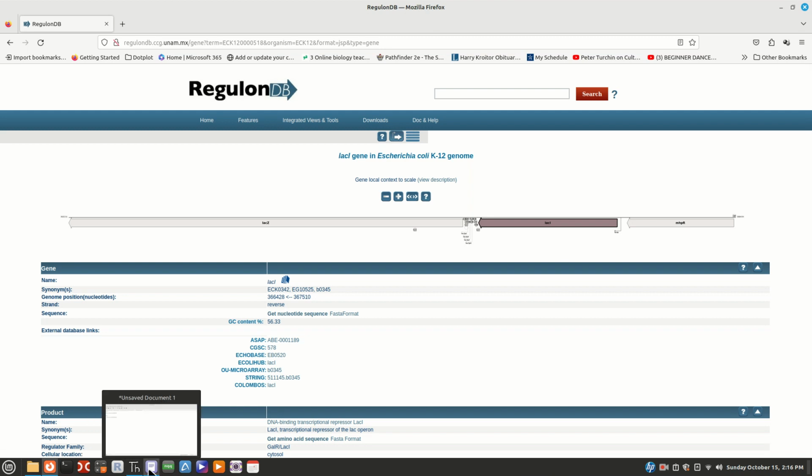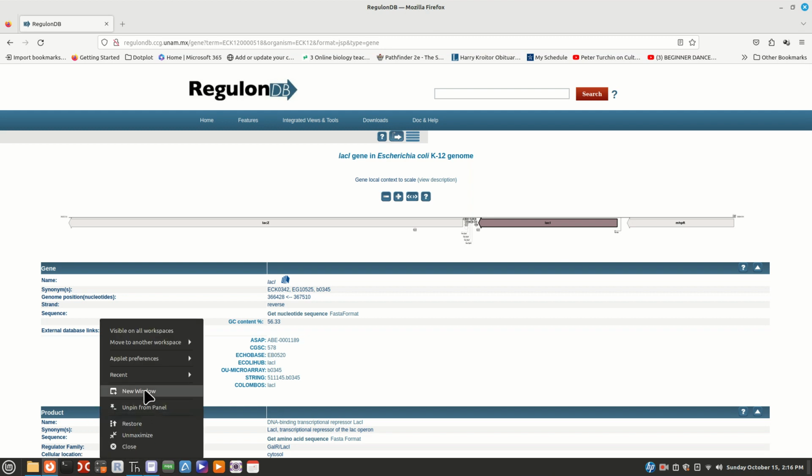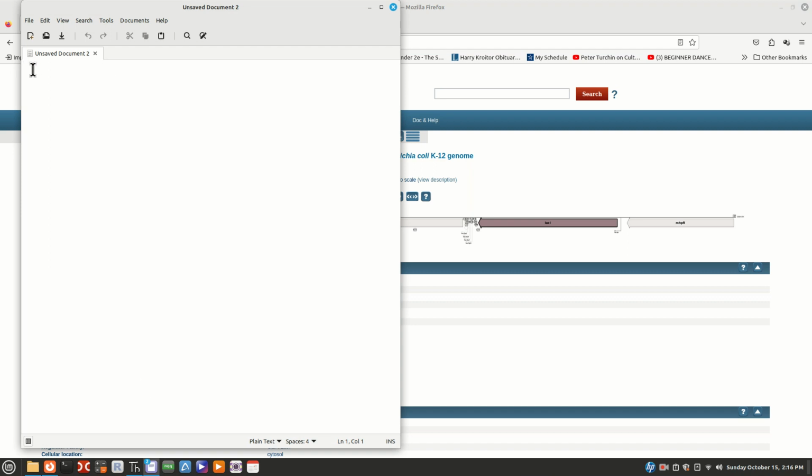So I'm going to open up a text file, and I'm going to copy those numbers. 366428, and what is this? 367510. So this is our lac I. Okay, just think of it that way.